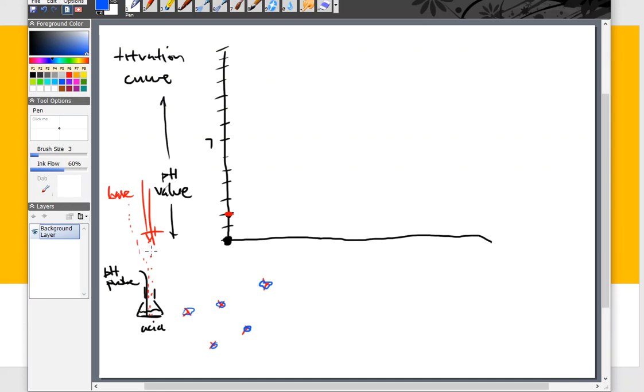Well, as I add the base, I'm adding the parents into that flask. And as the base goes in, the base is going to look at these little kids and go, uh-uh, you're coming home. Pew! Off it goes. They get killed out. Maybe that's not a very good analogy for parents and kids, but that's basically what goes on. We neutralize them.